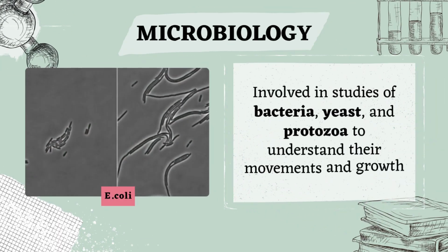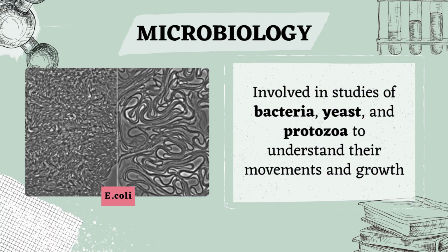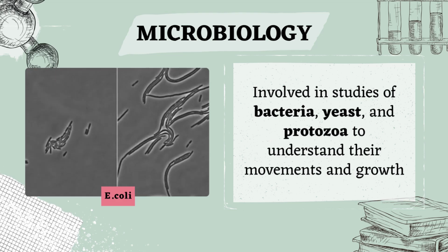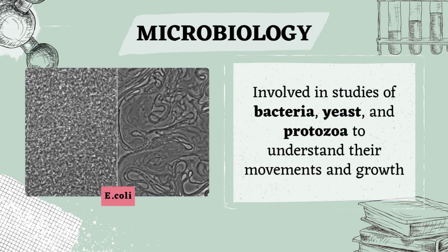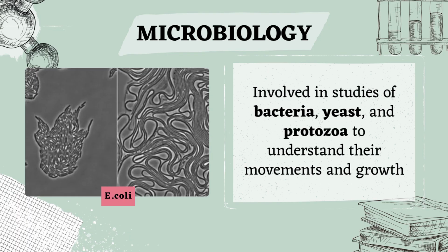Even in the field of microbiology, phase contrast microscopy is very much used, involved in studies of bacteria, yeast, and protozoa to understand their movement and their growth. As we can see in this video, on the left we have normal E. coli, while on the right we have modified E. coli.